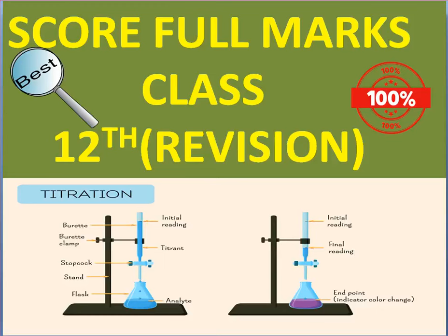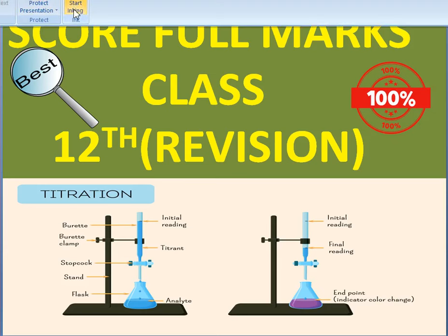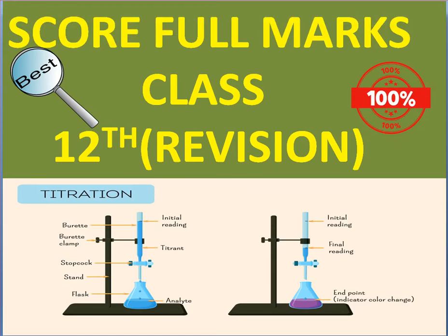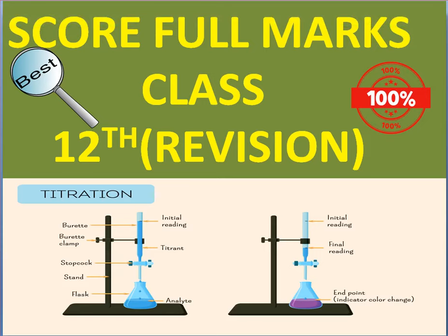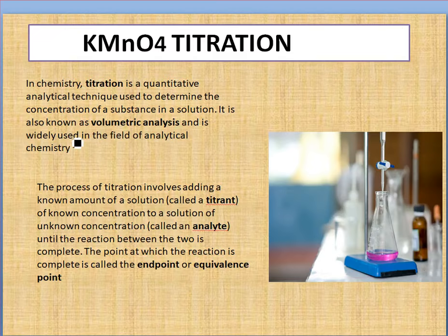Today the most important topic for the revision is titration. So we will start today titration, the quick revision in titration, so you can score good marks in titration. Clear? So let's start titration. First of all, what do you mean by titration?